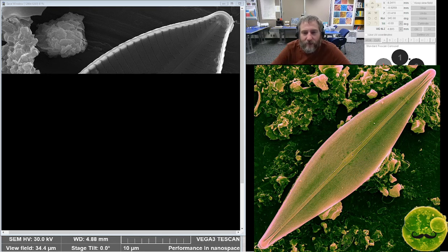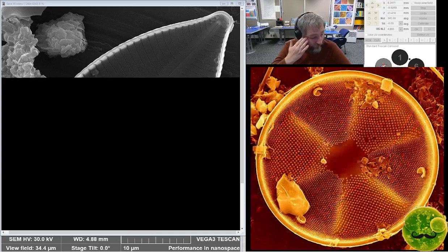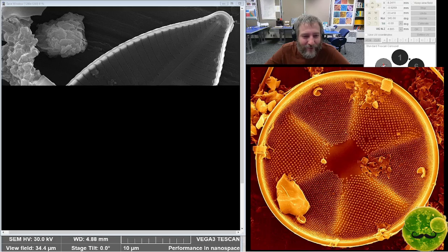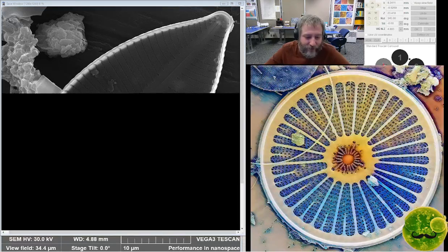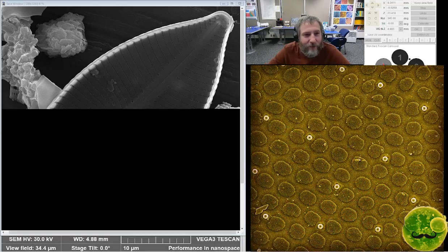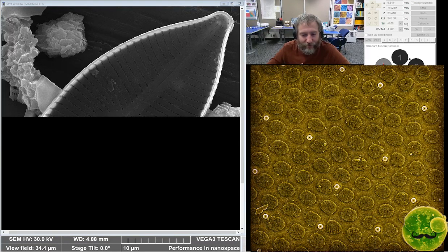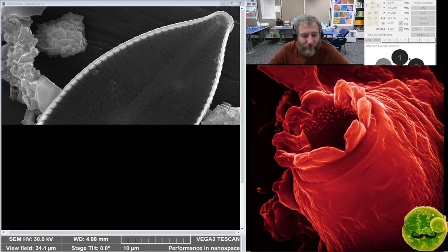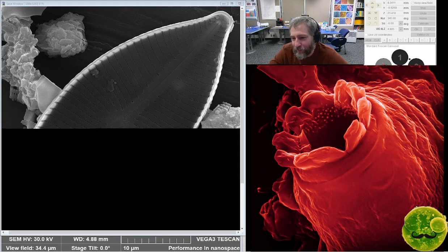One of the problems I started out having was getting a microscope with low enough magnification. All of my scopes are geared towards diatoms for the most part, so they need to have a 100x or 40x objective minimum, and that's times 10, so that's 1,000 or 400 times magnification. I needed a 10x objective, or 100 times magnification, in order to really start seeing them well, because I was a little too zoomed in. So it took forever to look through samples.